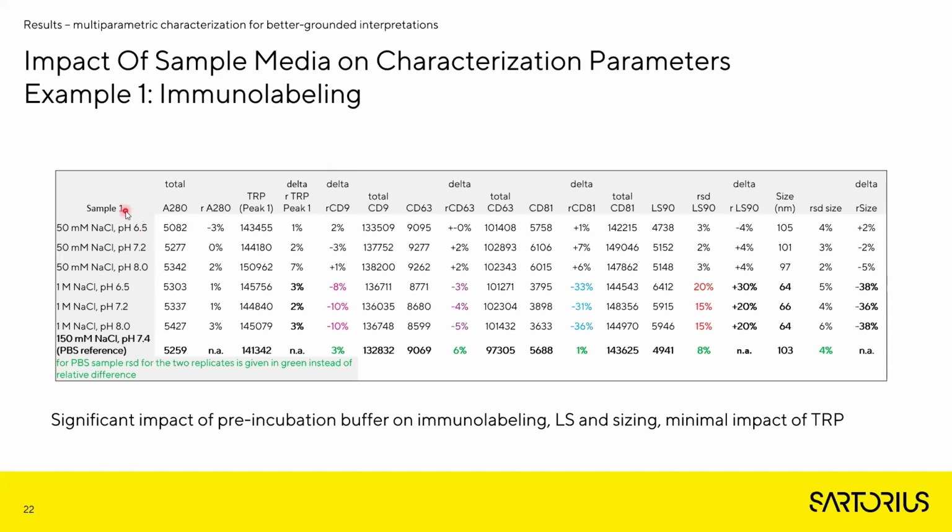Basically, the sample was spiked in this buffer together with the probe and analyzed after a sufficient time. We can see that in relation to salt concentration, we have changes in immunolabeling intensity. We can also observe an increase in light scattering intensity and a decrease in particle size.